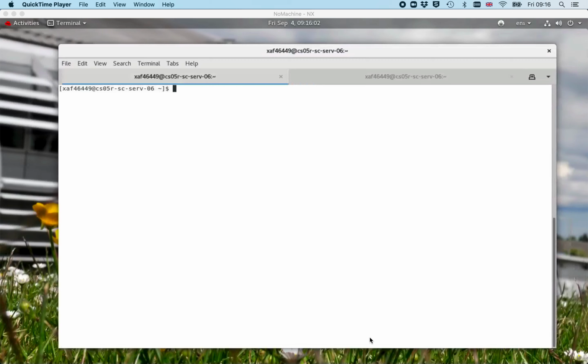I've had a request from a user for some help reducing HPLC data. There's already a video in the Scatter series on this, but we've subsequently upgraded from Scatter 3 to Scatter 4, which looks and behaves quite differently. So I thought I would quickly do another video on how to use Scatter 4 to reduce HPLC data.